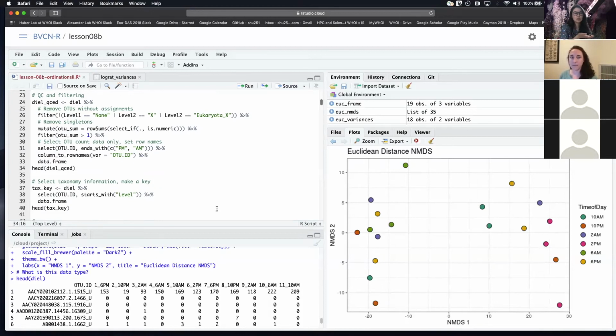So I knew that there was an issue with that sample. Mm-hmm. So you do it based on raw reads that are reported per sample, and then also how they look on an ordination? Well, when I start with ordination, my two modes of thinking are: I'll start the ordination with every sample and go through it. Right now, this data set does not have any blanks, but one example is that I would run the blanks through the data set to make sure the blanks do fall outside of some of these plots.